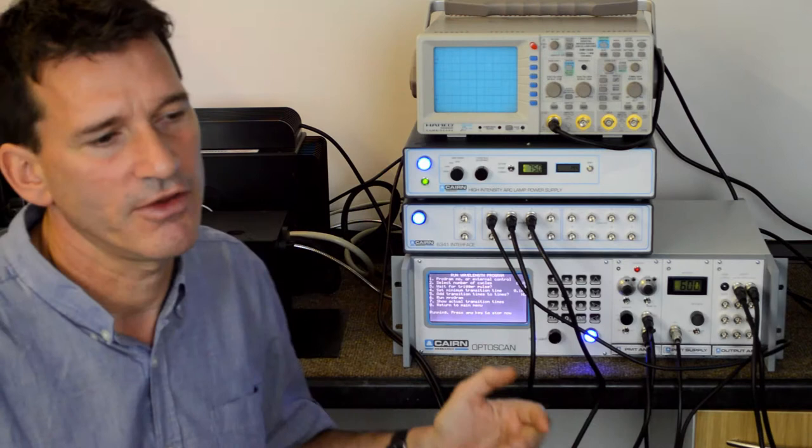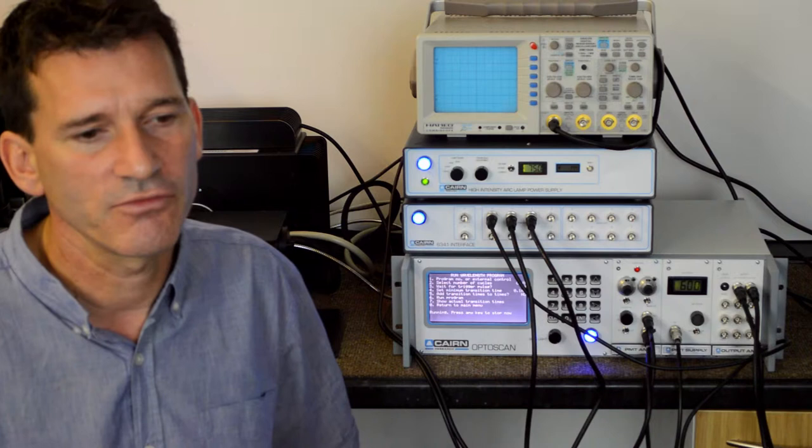So having done that, you will see the composite trace and the individual traces on the screen. They're all at levels in that 1 to 4 volt region.